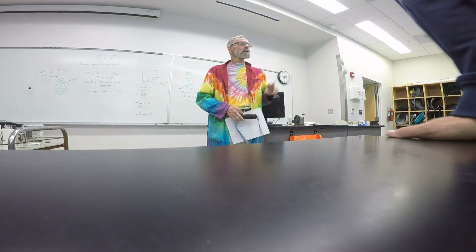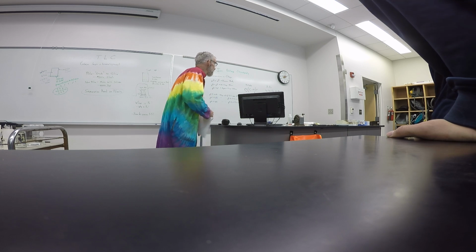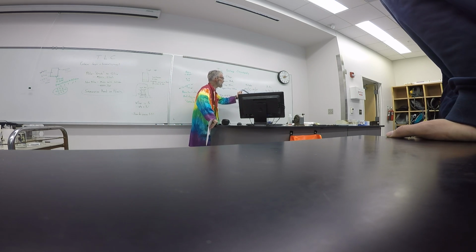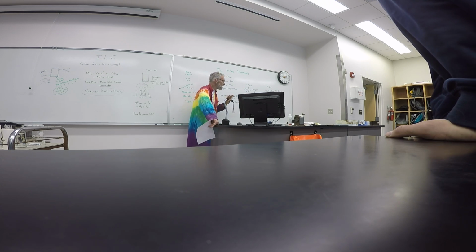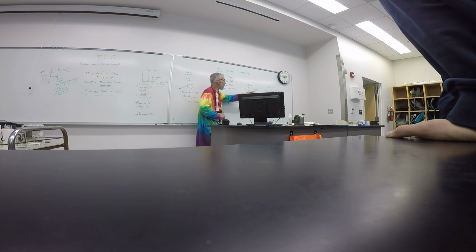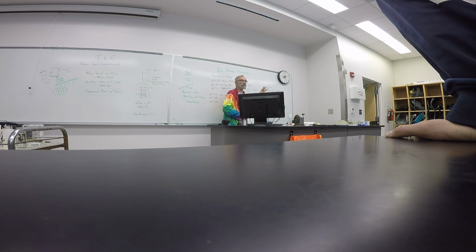Doing essentially two different experiments trying to identify an amino acid. The amino acids that we have for unknowns are lysine, serine, glycine, glutamic acid, phenylalanine, and leucine. So those are the 6 individual amino acids that you'll have for standards, and you'll have an unknown that's a mixture of all 3. And you're trying to figure out which 3 are in that mixture.